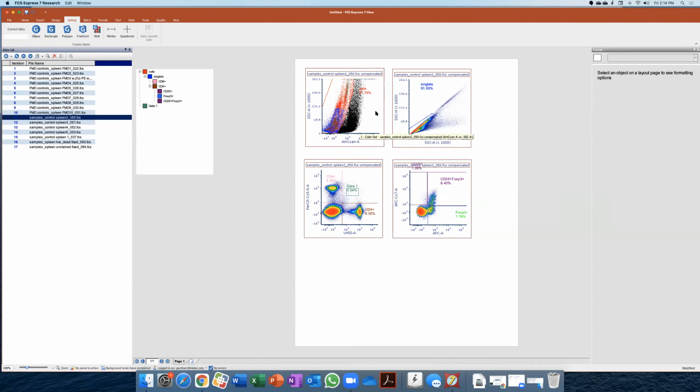Yeah, and then we do have a question that came in from B-Ling, and this is one that's always very difficult, and everyone always wants to know a solution. How do you handle multicolor assays when your sample volume is limited and the samples are very precious? Oh, it's a hard one, I think, for all of us. You handle them as carefully as possible.